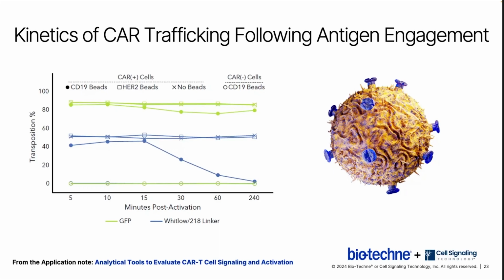These results indicate that CAR expression at the cell surface begins to disappear approximately 30 minutes after engagement with the target antigen, likely initiating an intracellular signaling cascade to drive T cell activation and effector functions.